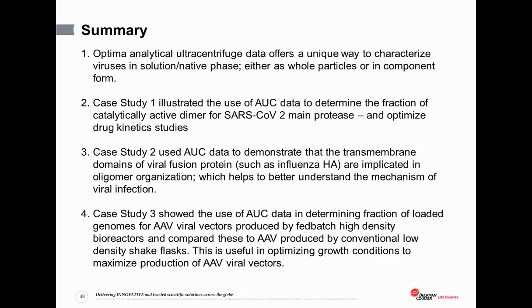Okay, so let's summarize everything that we spoke about. The Optima AUC data offers a unique way to characterize viruses in the solution native phase, either as whole particles or looking at the different components of viruses. In case study one, we discussed the use of sedimentation velocity AUC data to determine the fraction of catalytically active dimer for SARS-CoV-2 main protease. This information was used to optimize drug kinetic study.